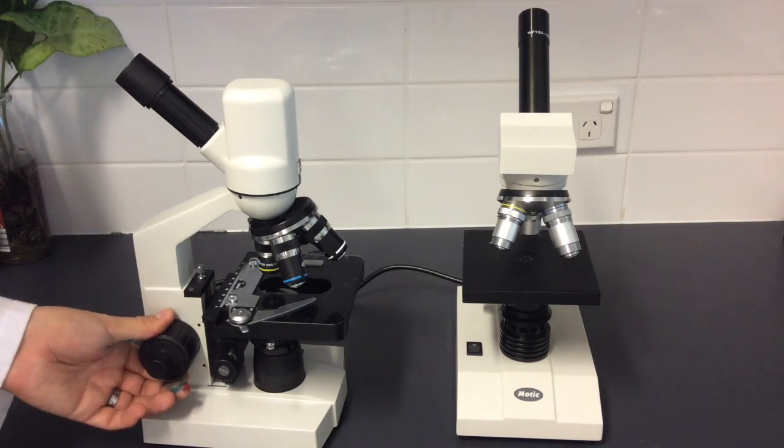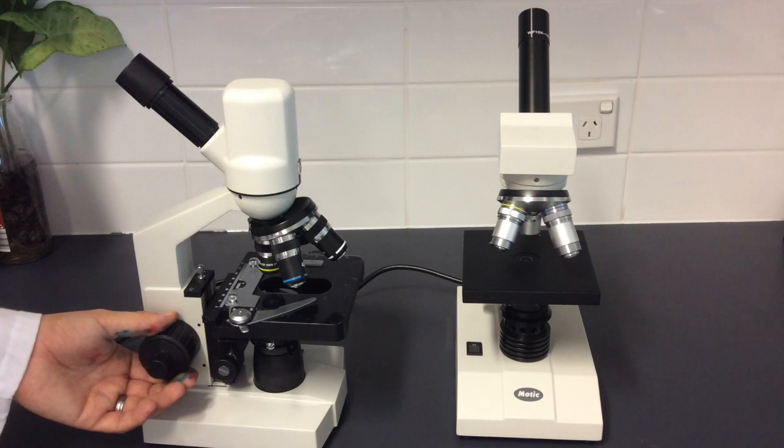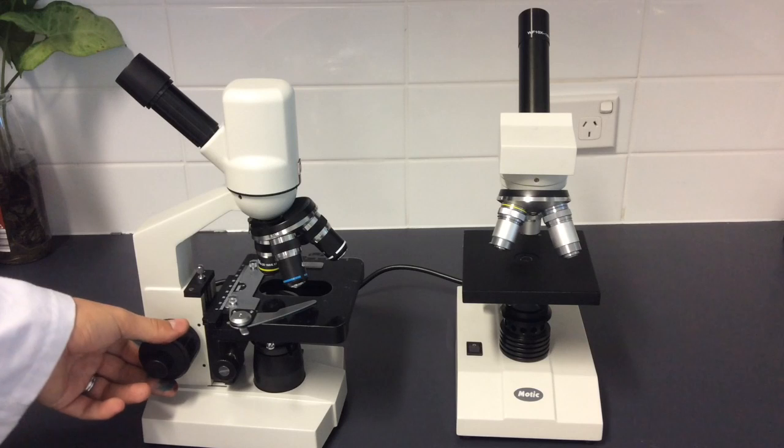This larger one here, often there's two of them separate but in this case they're both joined together. The larger one is called the coarse knob which moves the stage up and down. That brings the image into view.